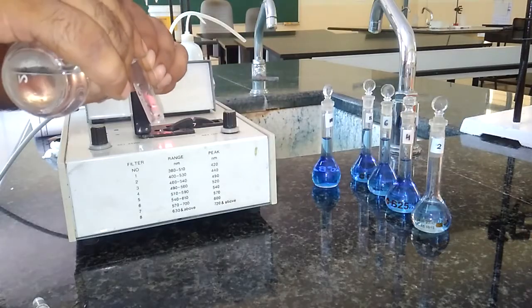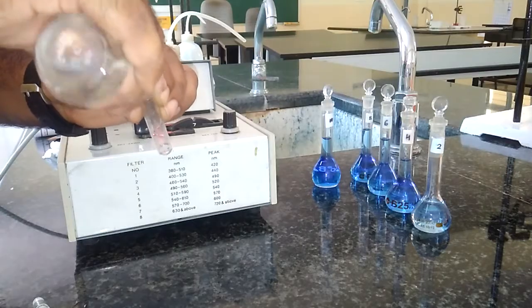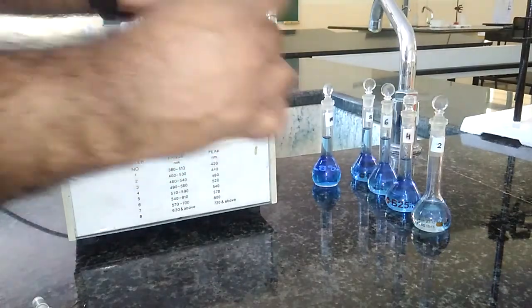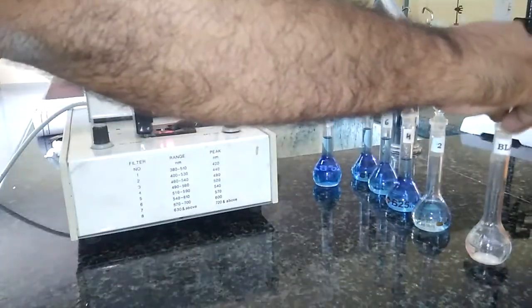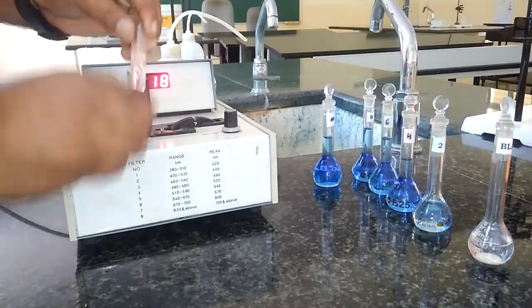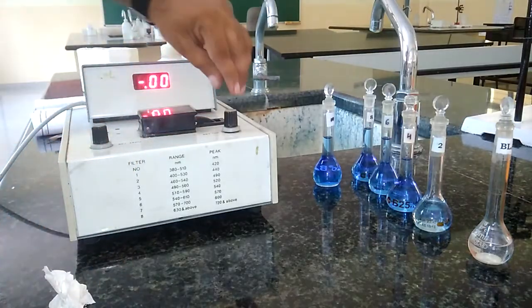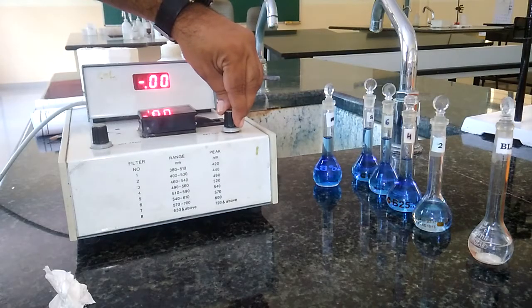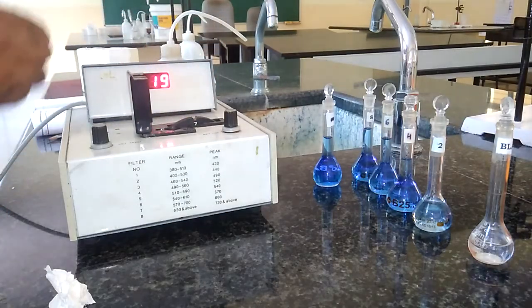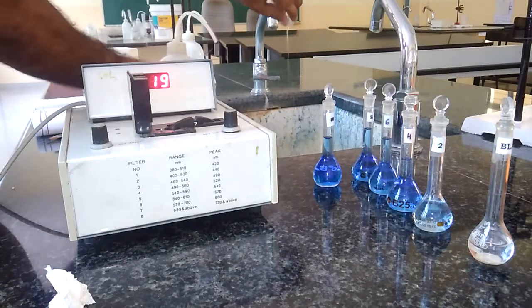I am taking the blank solution in this cuvette. We have to rinse this cuvette with the same blank solution, and then after rinsing, we have to fill it to three-fourths. We have to wipe this well before inserting in the colorimeter — wipe using tissue paper. We select 0 here. It is showing 0 now. After setting the optical density to 0, we discard the solution and wash with distilled water.